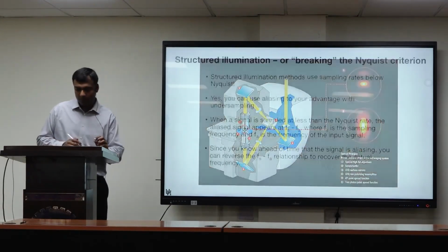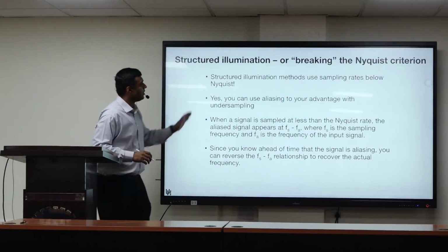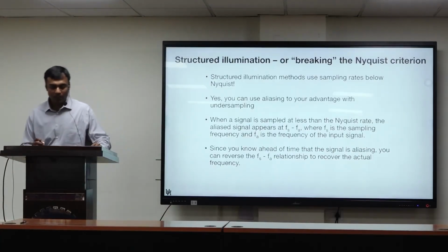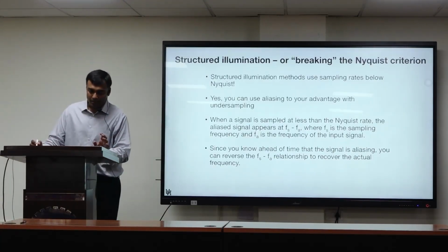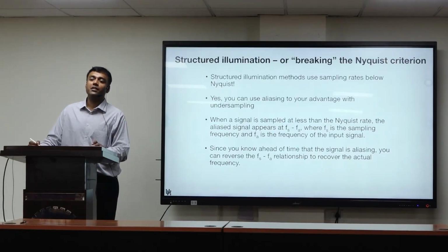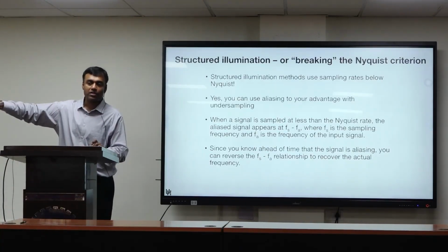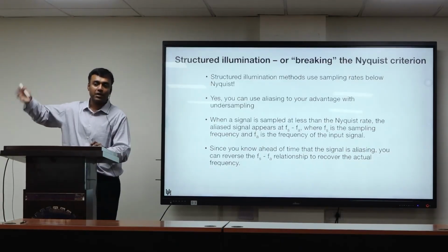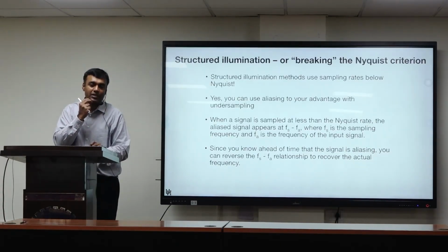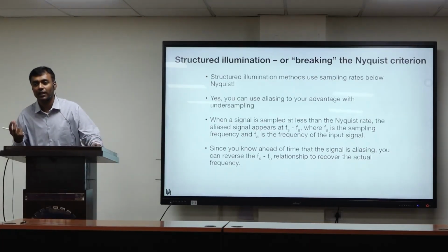Okay. So another kind of approach aims to break the diffraction limit. In other words, how do you get better information than the diffraction limit? So we are heading towards how to see smaller and smaller things. The diffraction limit is a fundamental limit because of the wave nature of light.